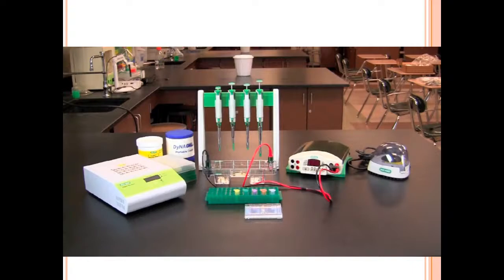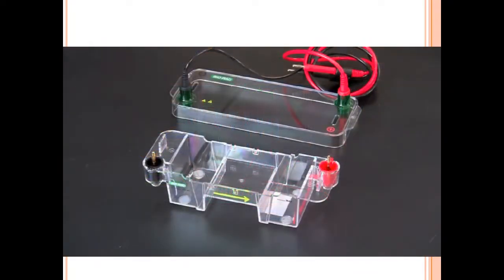This video will take you through the process for loading and running DNA samples on an agarose gel. You will be using a mini subcell to perform agarose gel electrophoresis. The subcell has an electrode wire running across the bottom of each end. This provides for an electric current to pass, which separates the DNA fragments in the samples. First, align the gel so that the wells are closest to the negative or black electrode. DNA is negatively charged and will move from the negative electrode through the gel toward the positive or red electrode.